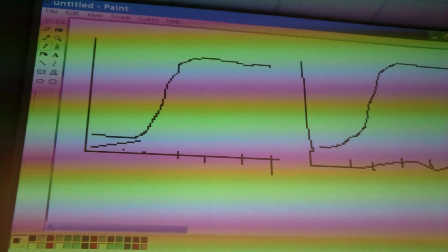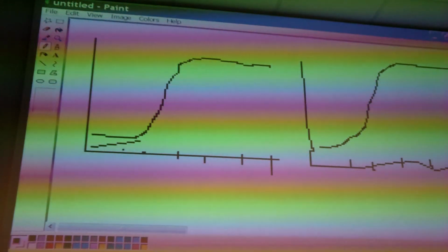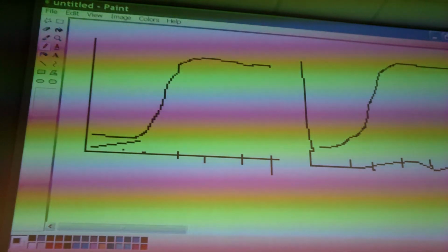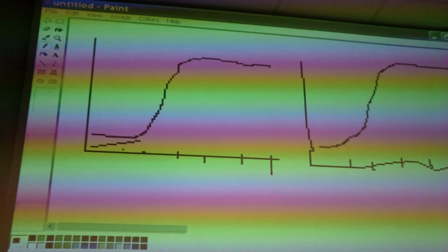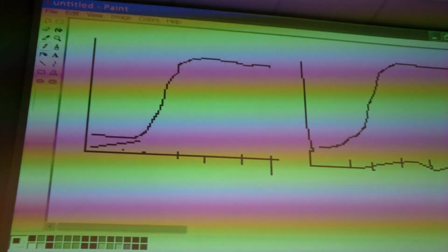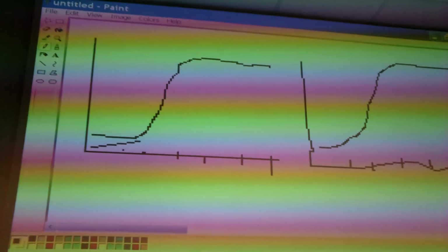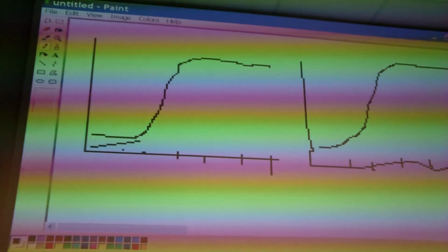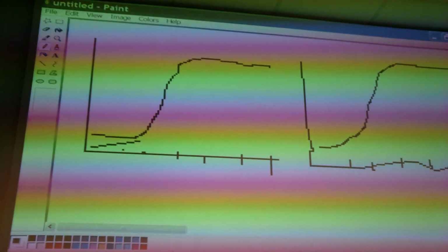A little bit abstract. So the amount of shift, yeah, shift, you can say. The difference in slope. The slope, yeah. And the slope is actually... no, the slope is actually always the same. If you dilute a factor 2, the OD will drop by a factor 2.